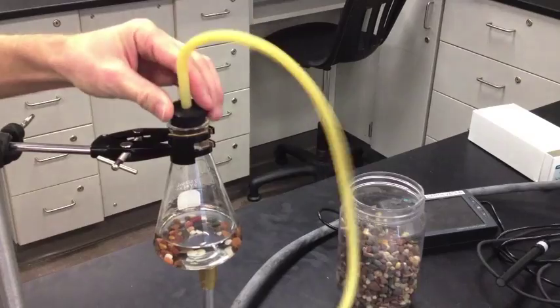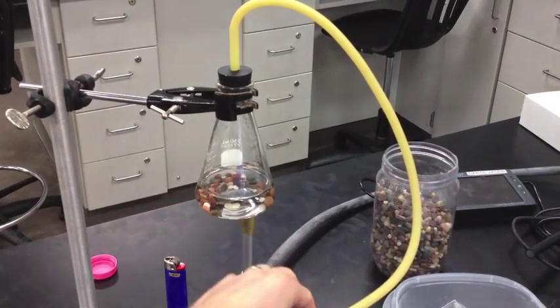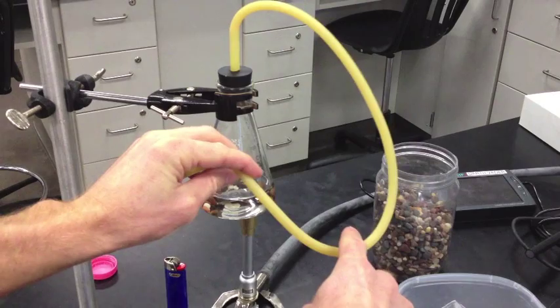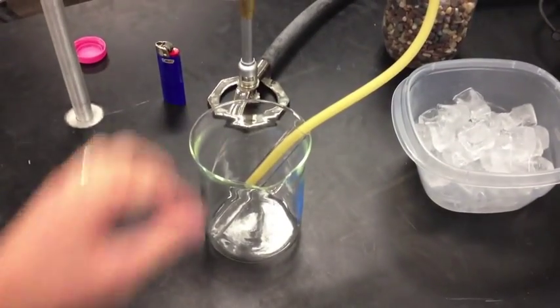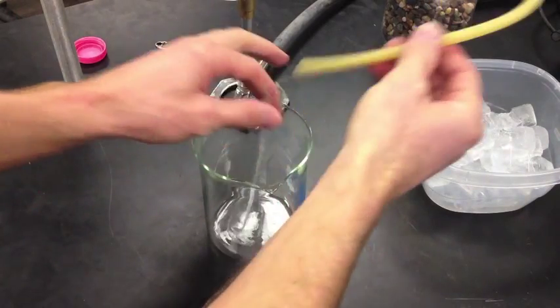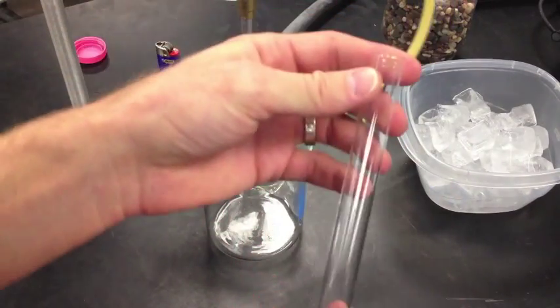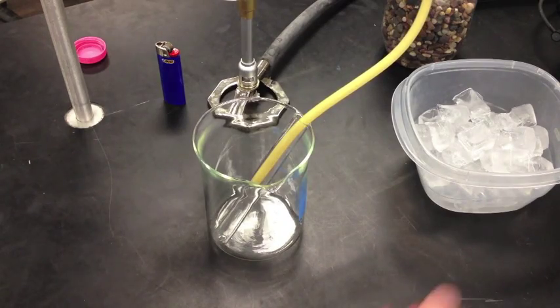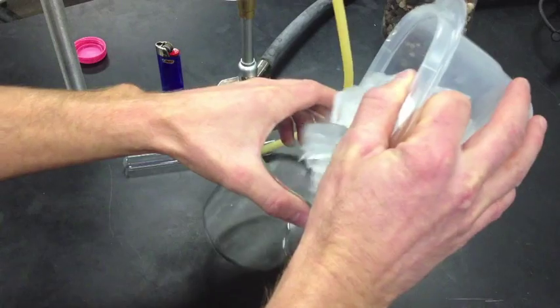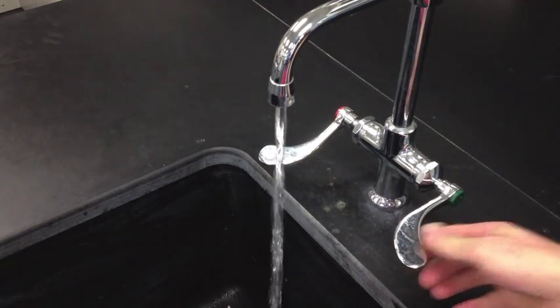Replace the cap on the Erlenmeyer flask. Make sure that the rubber tube is going to travel continuously down without having a bend or a kink in it where water can start to build up — that can be dangerous, so make sure it's a straight line going all the way down. The collection test tube has to be extremely clean because you're going to be collecting clean, pure distilled water, so rinse it out several times with distilled water. Collect it in a 600 milliliter beaker that contains an ice water bath — ice and water to make an ice water bath.